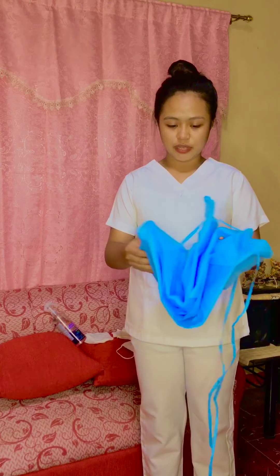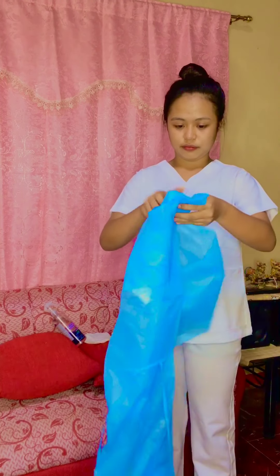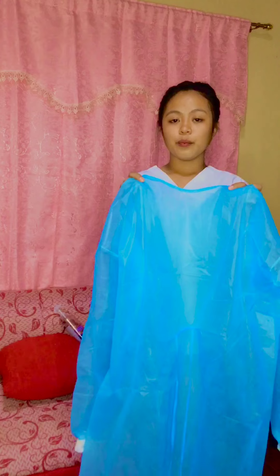So first, we need to do hand hygiene. Next, don your PPE gown. Open your gown fully. Put your gown into the opening and arms into your sleeves.